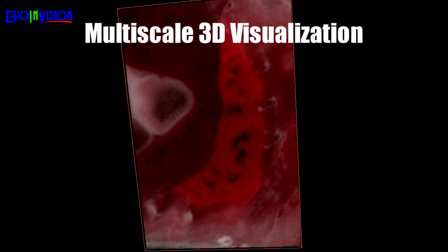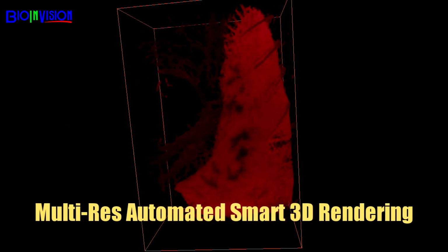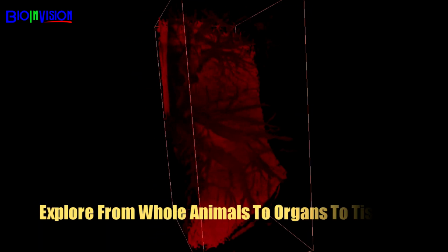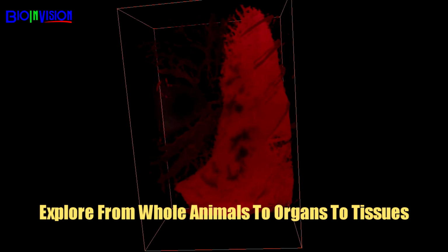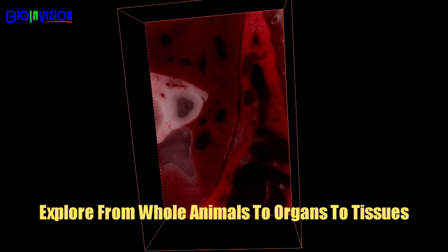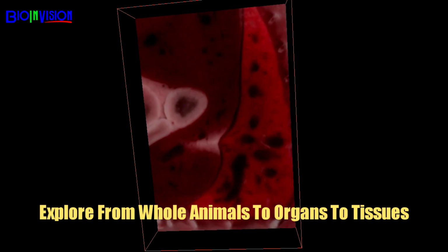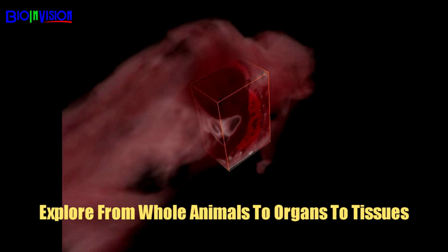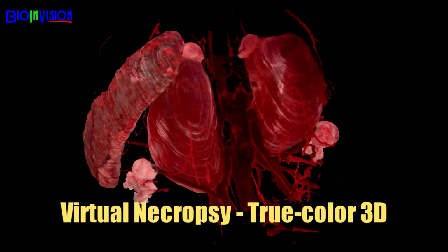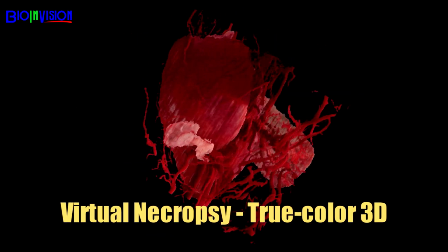The CryoViz instrument employs patented technology and has been in use for over a decade. It is a fully automated sectioning and imaging system that acquires high-resolution images from frozen tissue block face. It's all done by serial ultra-thin sectioning and imaging of block face with each specimen. Now let's turn back once again to what this technology makes possible.